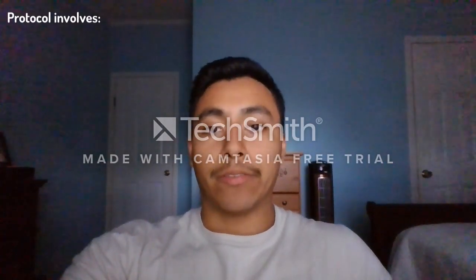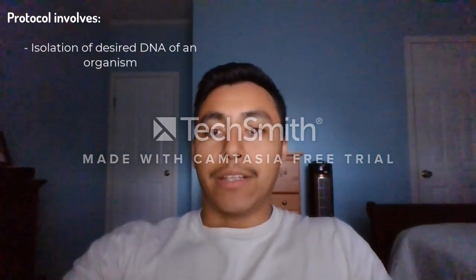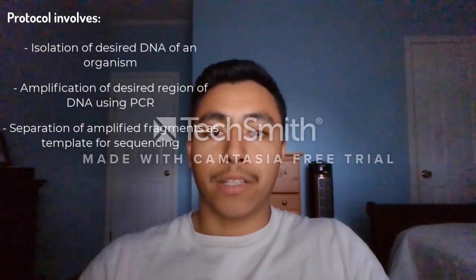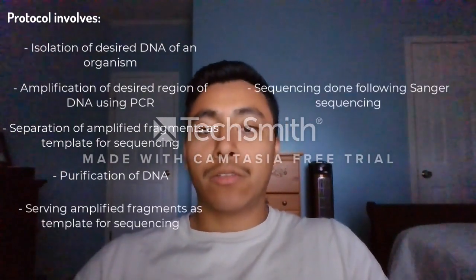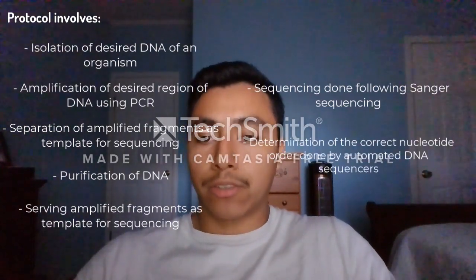The protocol involves different processes, including the isolation of desired DNA of an organism, the amplification of the desired region of DNA using PCR, PCR being the making of many copies of desired DNA fragments, the separation of amplified PCR product done by gel electrophoresis, purification of DNA, serving amplified fragments as template for sequencing, sequencing done following Sanger sequencing, and determination of correct nucleotide order done by automated DNA sequencers.